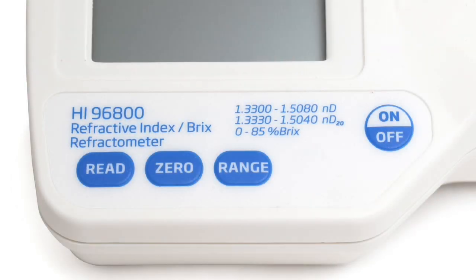The HI-96800 has a very simple layout with four dedicated keys: one for turning the meter on and off, one for calibration, one for taking a sample measurement, and one for selecting the appropriate range to be displayed.